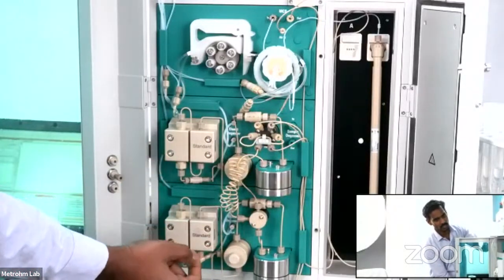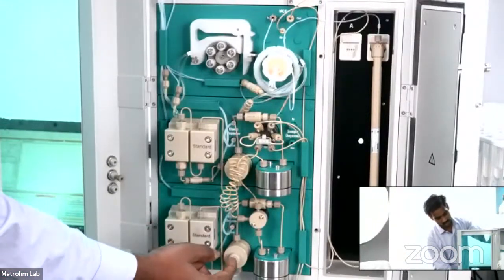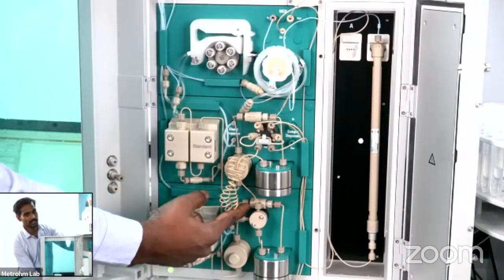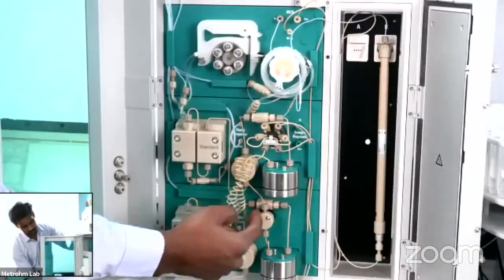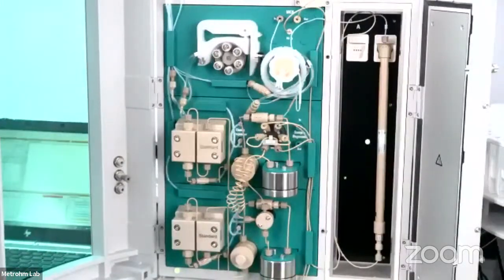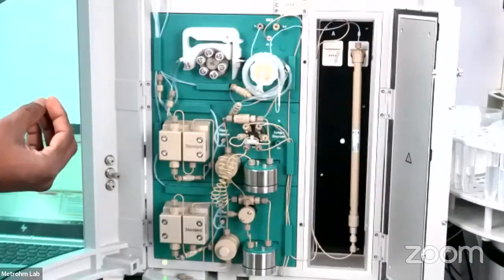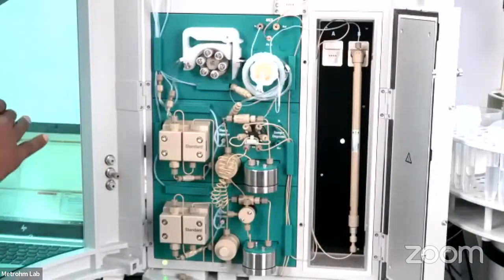So it is called the purge valve. Any air bubbles in the line can be removed by using this purge valve. After this purge valve, it is going to the inline filter. Here, any particles in the eluent will be taken care of. After this inline filter, it is going to the pulsation dampener. It is just a pulse reducer, we can say. This high pressure pump works like a pull and push mechanism, so there is some flow gap in the eluent flow. If you use this pulsation dampener, it smoothens the baseline, or rather, it smoothens the flow.